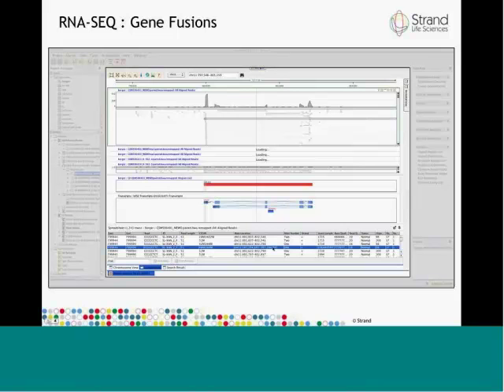If you click on one of those reads, you can see that this read itself had a start and end close to 800,000, but the mate location is far away at roughly 100 million location. And that is how you can verify this gene fusion happening here.